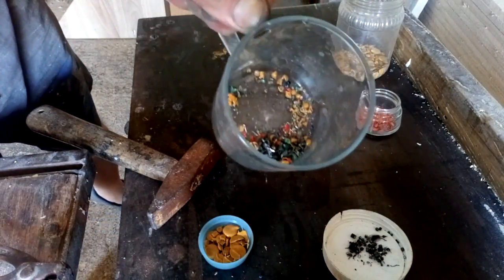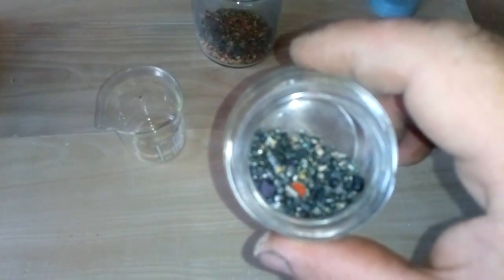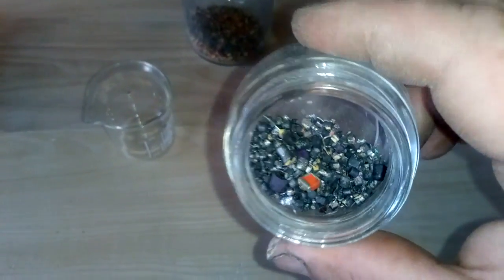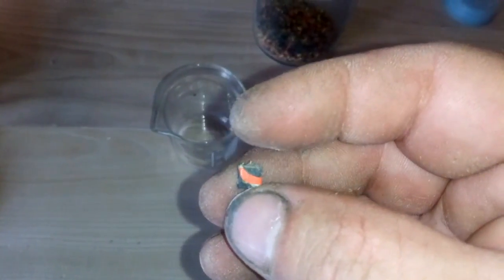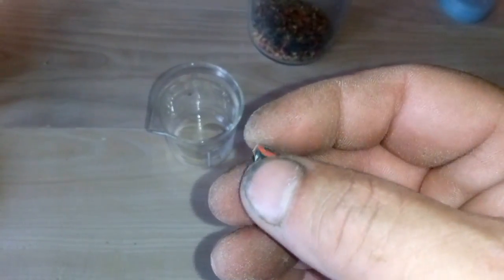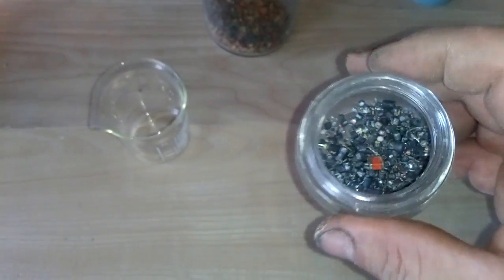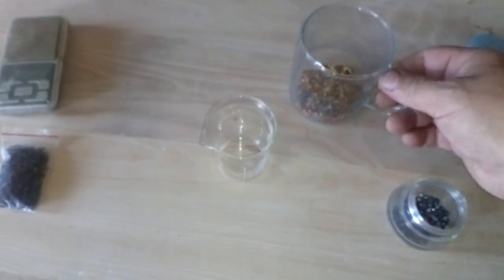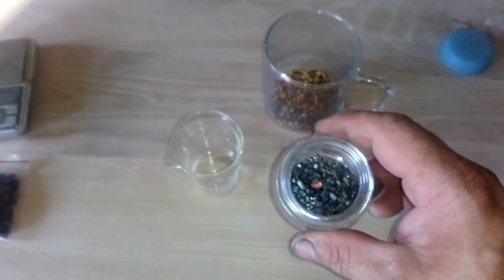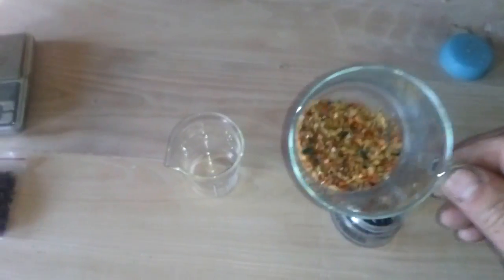We're going to keep those scraps just to try to recover some silver. After cleaning, this is our tantalum. We got more inside the red ones — they look like MLCCs but they're not. You can see the black inside and here's the wire. We'll put them together and see what happens. These are our leftovers. We will first boil them in hot nitric acid, then use the same nitric acid to process the shells for some silver.